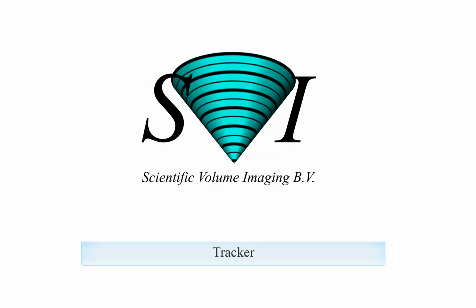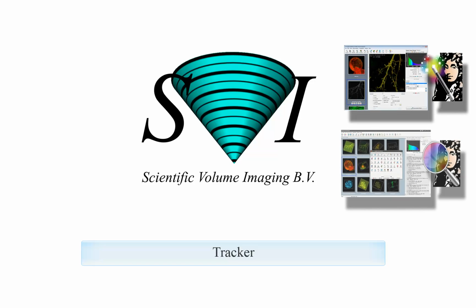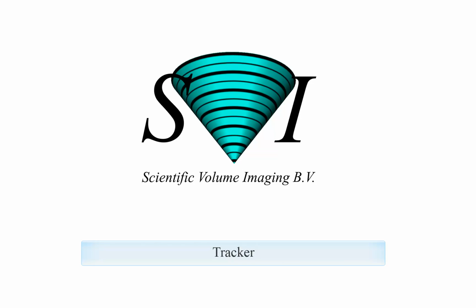Welcome to this tutorial on the Object Tracker in Huygens. This tool is available for Huygens Essential and Professional. The Huygens Object Tracker Wizard and Track Analyzer can be used to study 2D or 3D motion of cells and smaller particles in time series images.